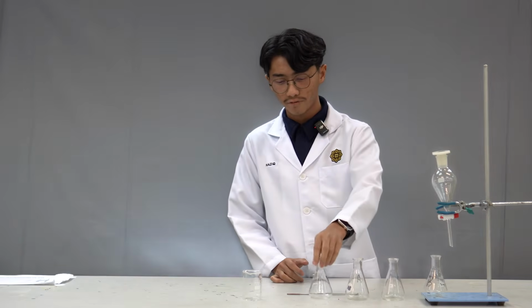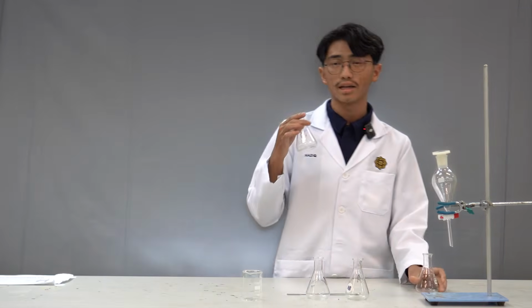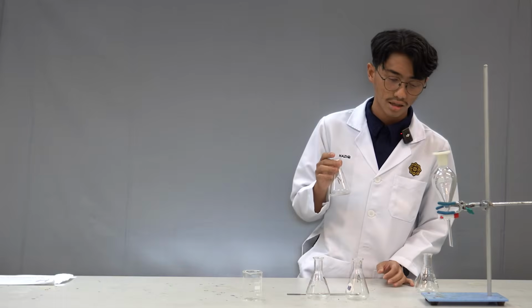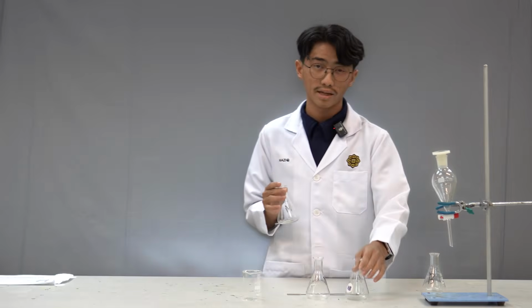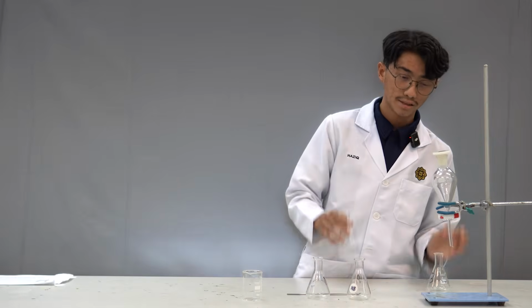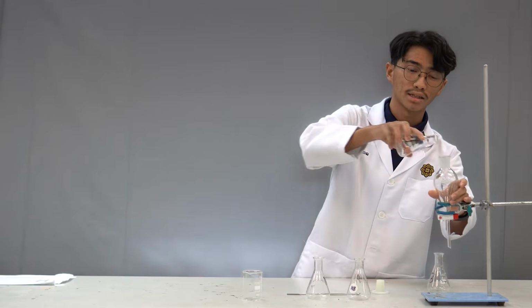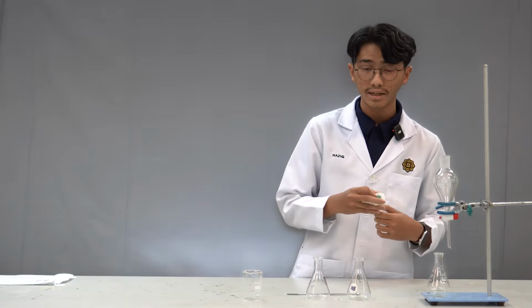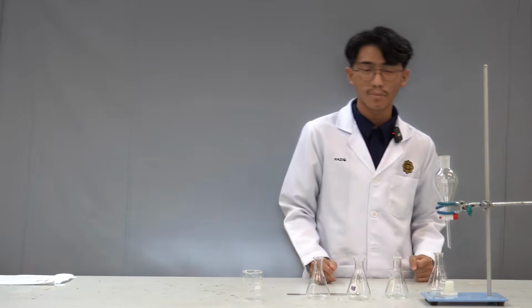So now I will continue the experiment from separation of base. In this mixture flask, they still have neutral and base. So I'm just going to follow the same steps as separation of acid. For separation of base, first we put the mixture flask in the separatory funnel, and then we add 10 ml of 5% hydrochloric acid.